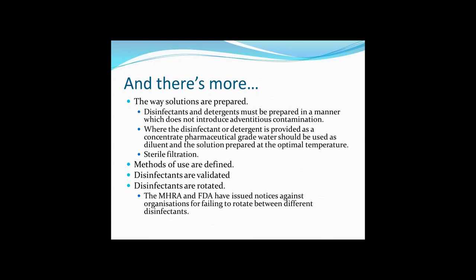Another factor is temperature as well, because disinfectants are affected by temperature, and generally the cooler the temperature, the less effective the disinfectant will be. Then there are requirements about the methods of use. There's a stipulation that disinfectants are validated according to a particular standard, and I'll touch on that a little bit later on. And then the rotational issue again.